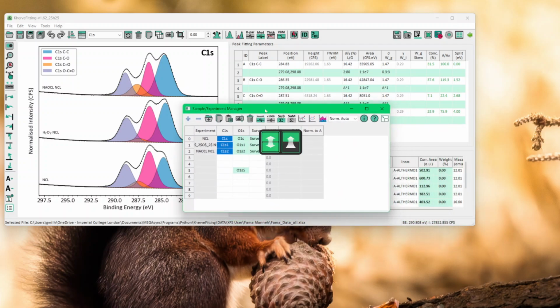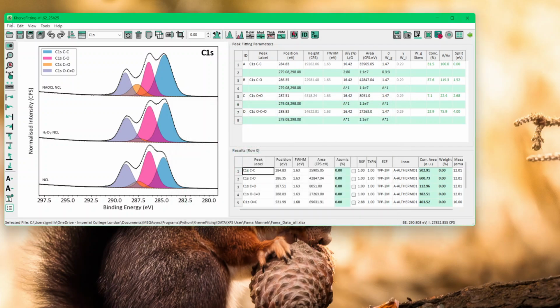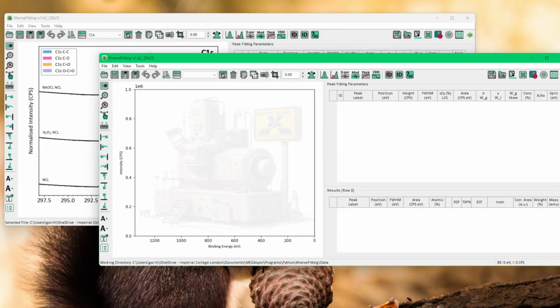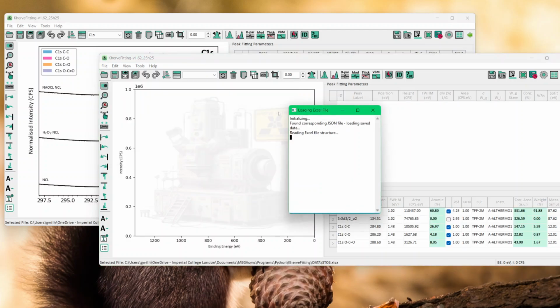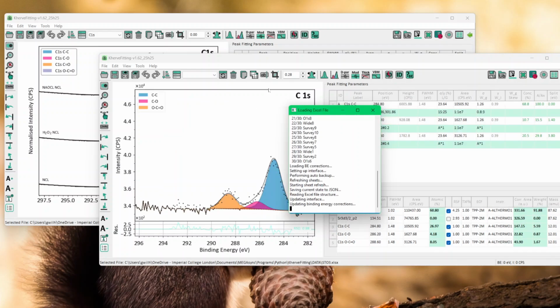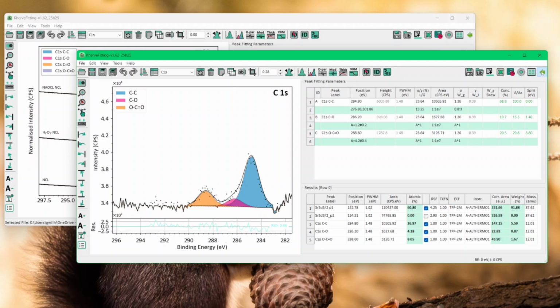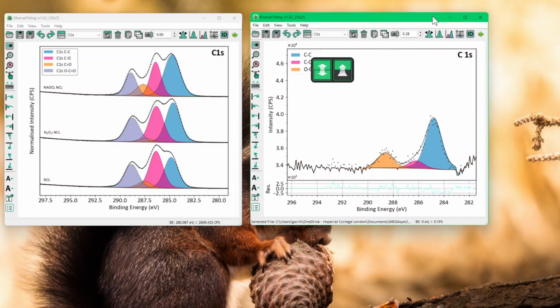Another way, by the way, of copying files is to open a new instance of KherveFitting. So right now, I've just reopened a new window, and here you can add a new set of data, let's say a big file like this one here. And if you feel this is too many windows, too big windows, just minimize them. Let's put them next to each other.